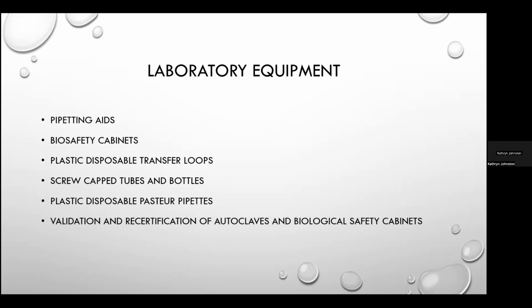The laboratory should have plastic disposable transfer loops, or alternatively, electric transfer loops. Incinerators can be used inside the biosafety cabinet to reduce aerosol production. They should have screw cap tubes and bottles, and plastic disposable Pasteur pipettes whenever available. The reason for that is to avoid glass, which is a risk for sharps injuries.